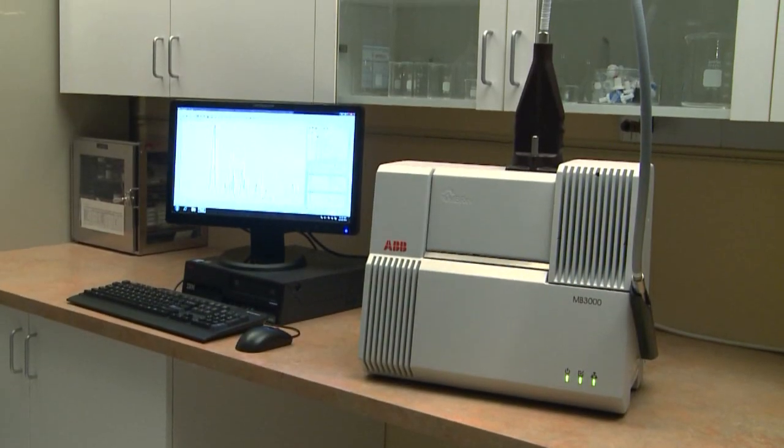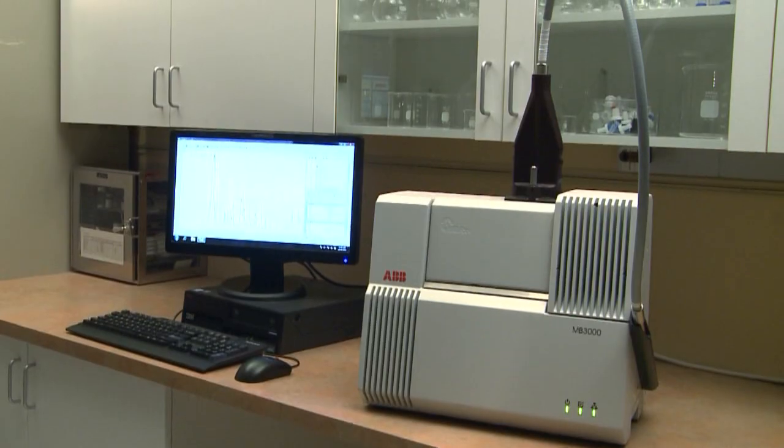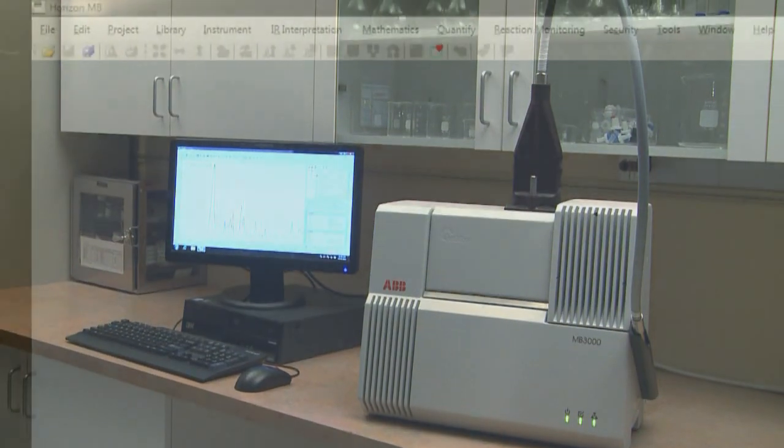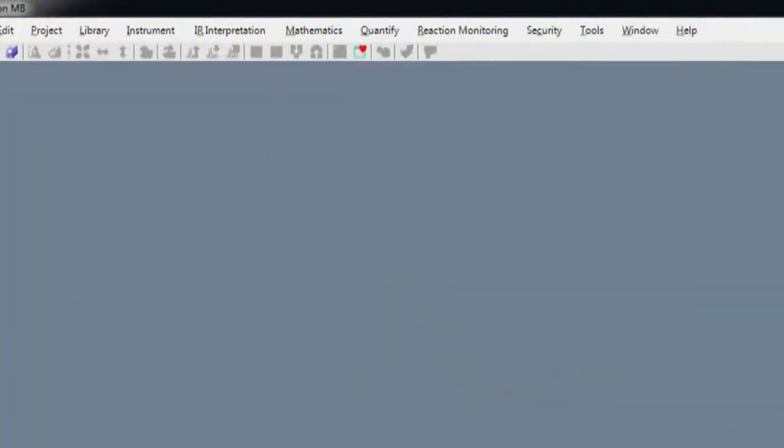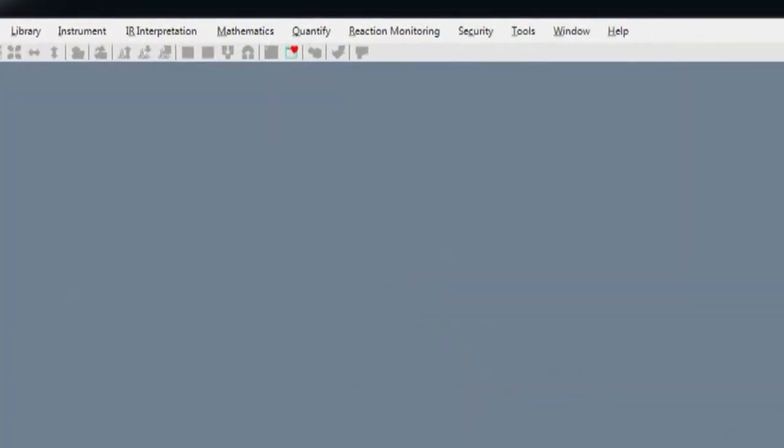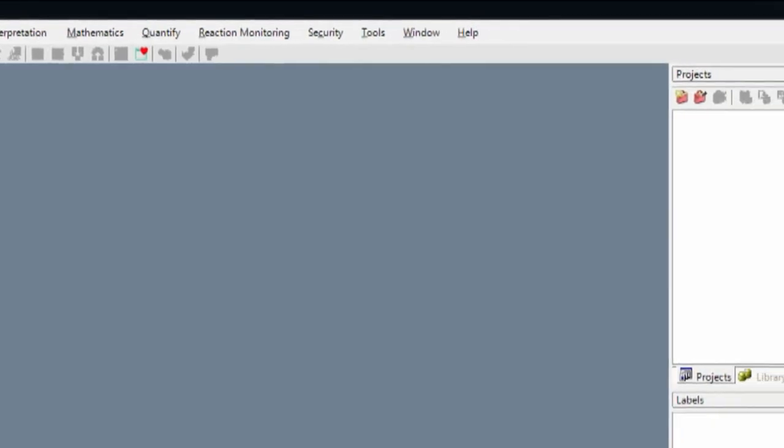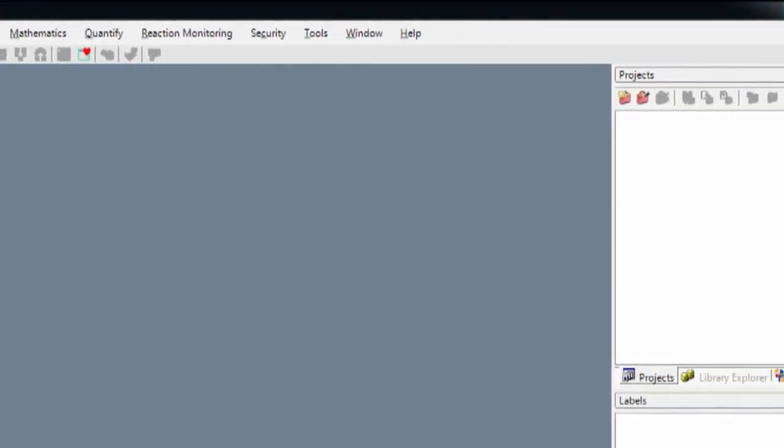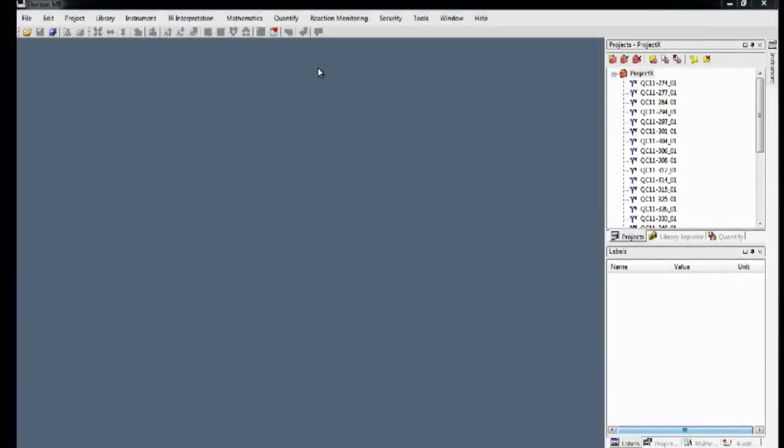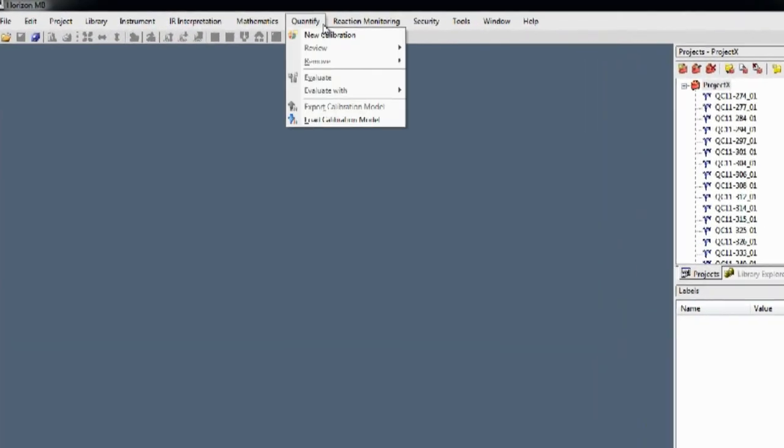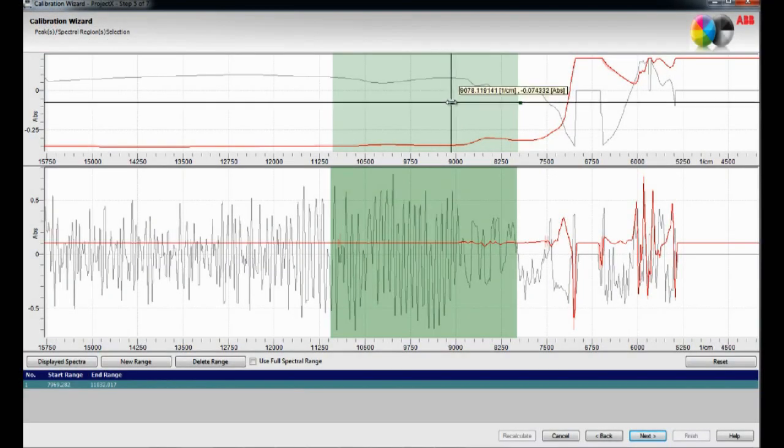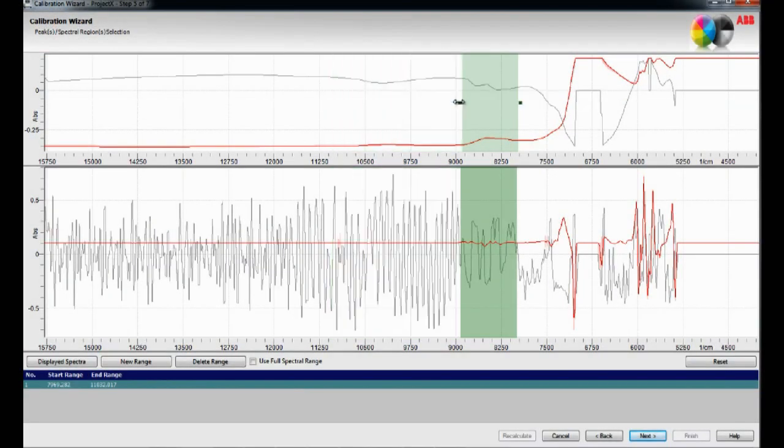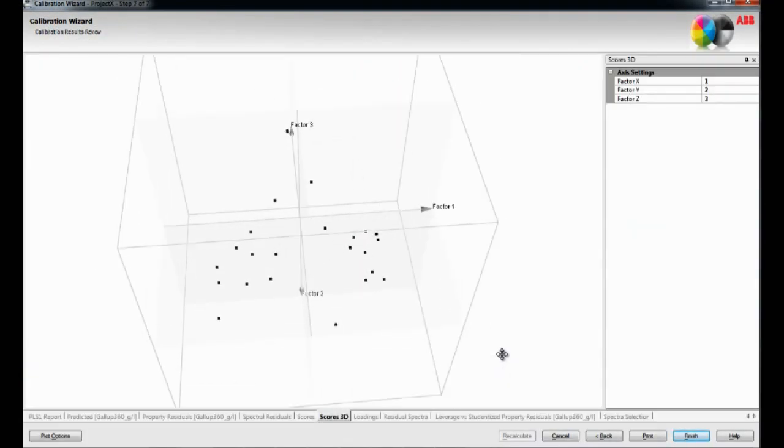The MBRX features the ABB Horizon MB Software Suite, the latest generation of analytical software. It integrates several intuitive modules that provide all of the functions required to control the instrument operations, and to analyze and quantify real-time data generated during chemical experiments.